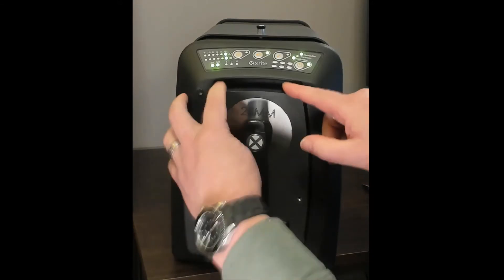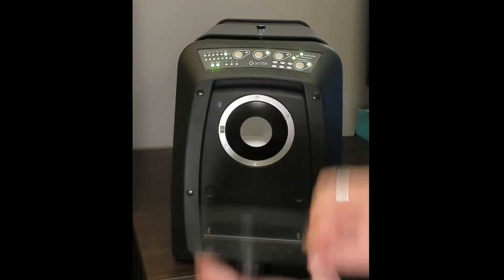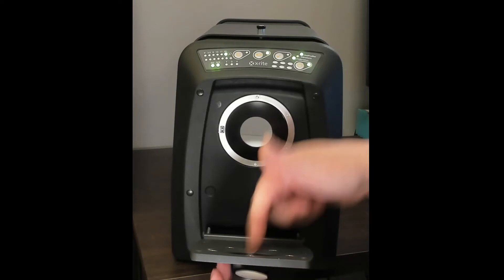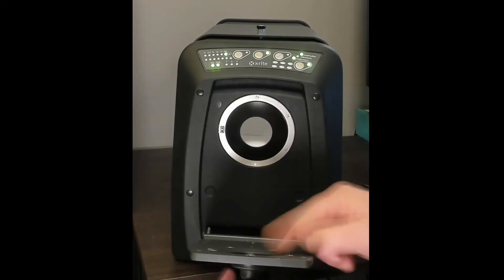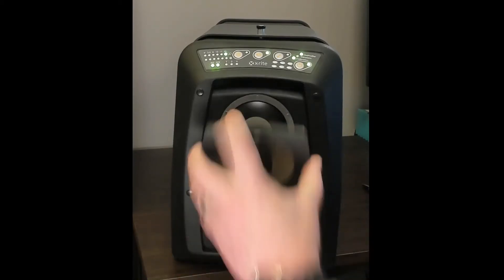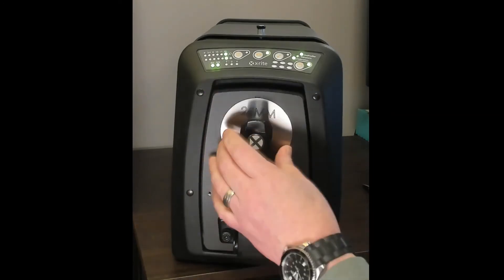I can also pull down the whole door, which allows me to actually see what's going to be measured if I've got a sample loaded. I can put my finger right through the opening and physically see what's going to be measured before I take the measurement. I'll show you in a different view a better way to do that as well.